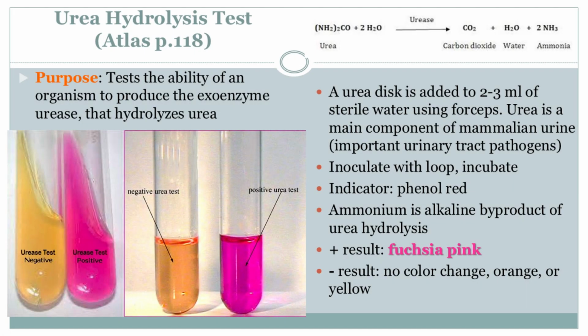Ever wonder how doctors figure out exactly which bacteria is causing an infection? Yeah, it's like a microbial game of Clue, isn't it? It really is. But today, we're going to dive deep into a test that cracks the case. And get this, it uses a simple color change. That's right, the Urea Hydrolysis Test.